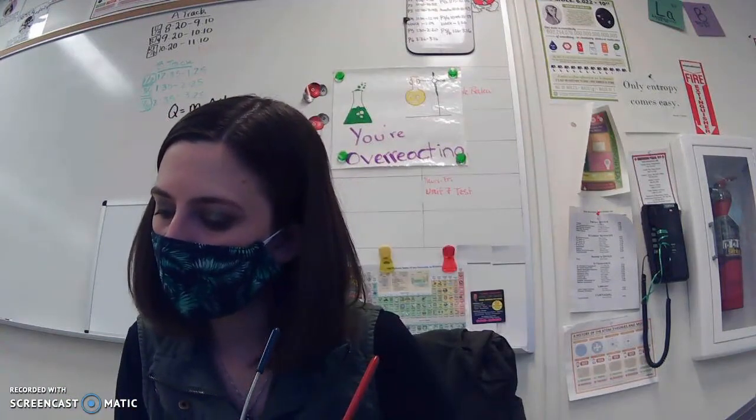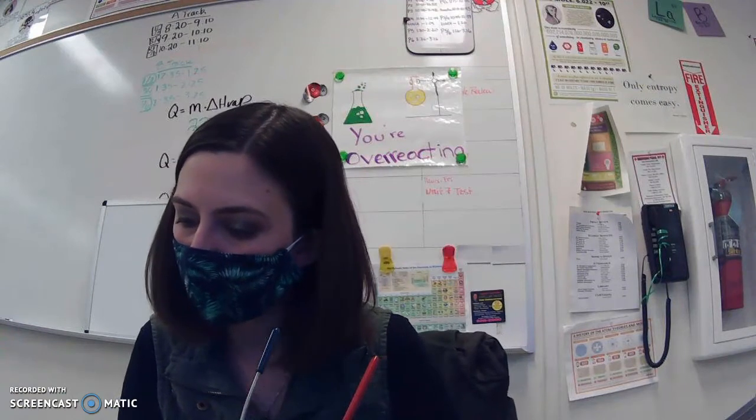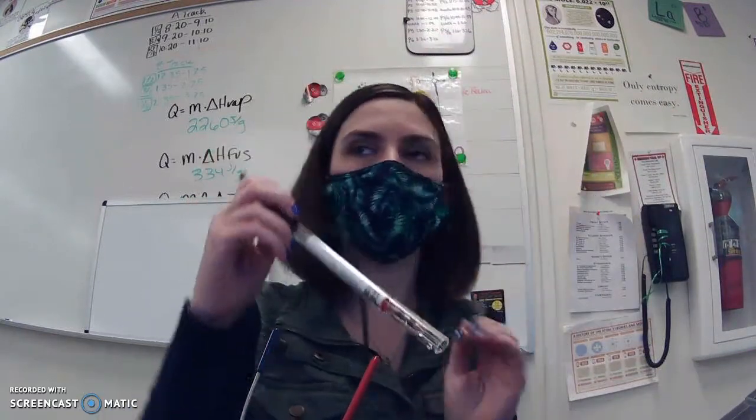We're going to test it in the conductivity tester and see what it's going to tell us about the water. So we'll turn on our tester again. And it's all cleaned up with our DI water. And we're going to test our river water sample. Okay.